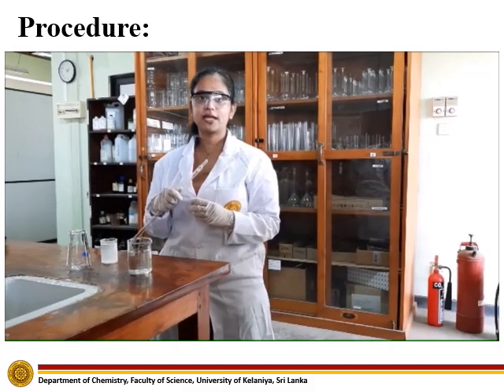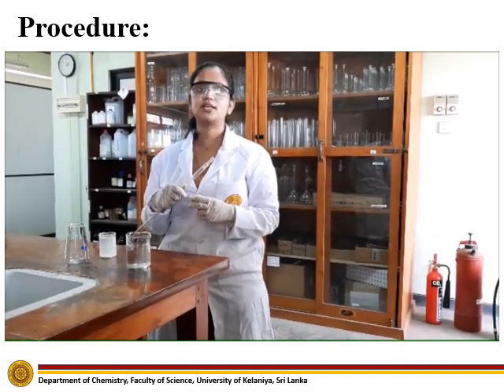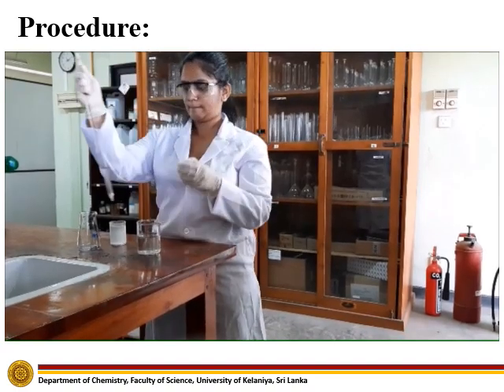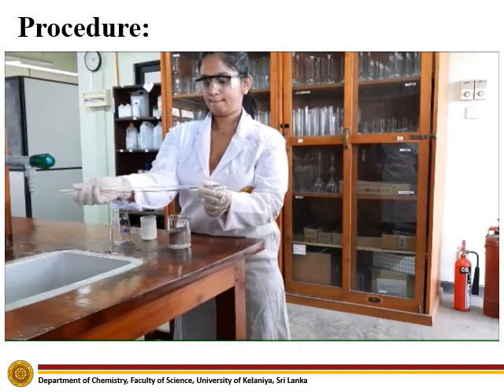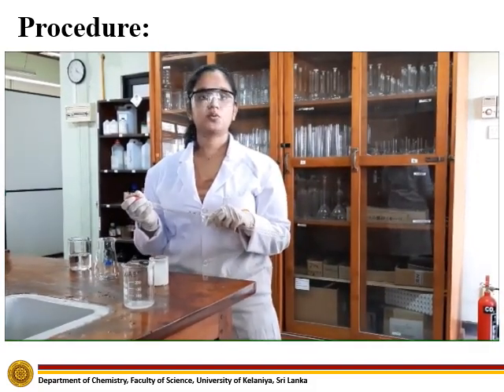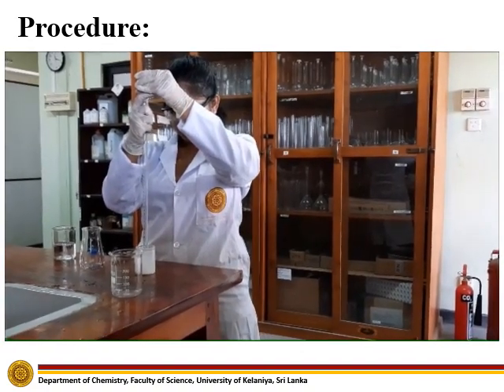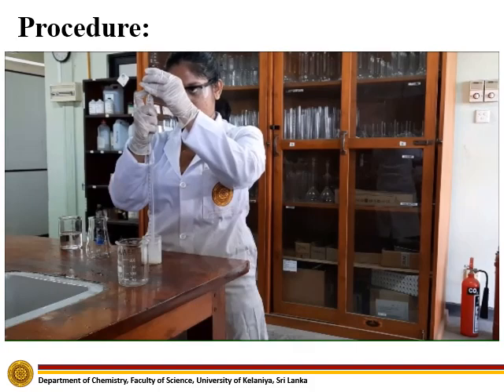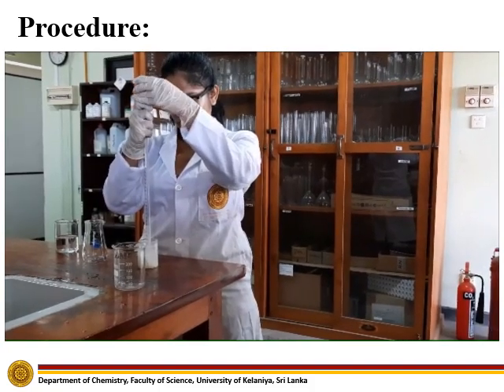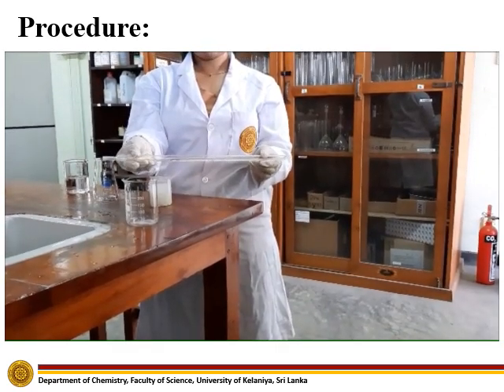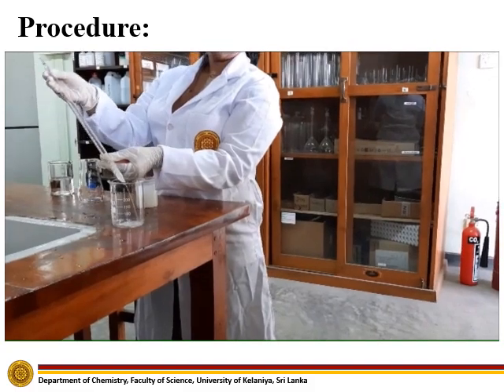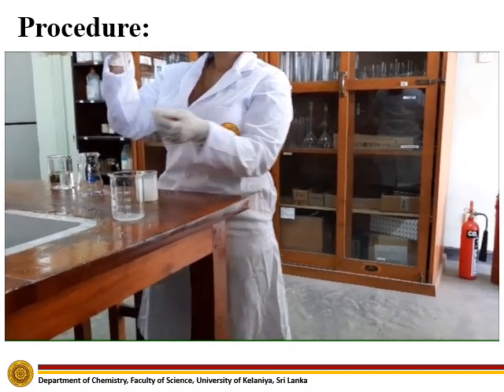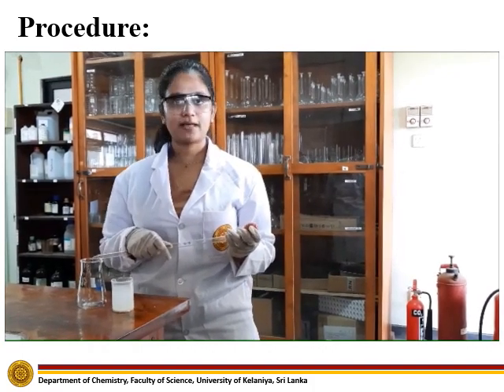Now let's wash the pipette using distilled water prior to measuring 25 milliliters of calcium hydroxide. Now let's also wash the pipette using the prepared calcium hydroxide solution. Now let's measure 25 milliliters of calcium hydroxide solution.